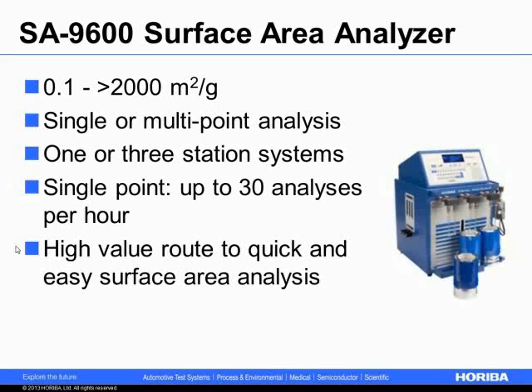So the higher surface area, the more reaction sites for the SO2 and SO3 sequestration. And monitoring particle size kind of indirectly gets you a surface area measurement. This will give you a direct one.